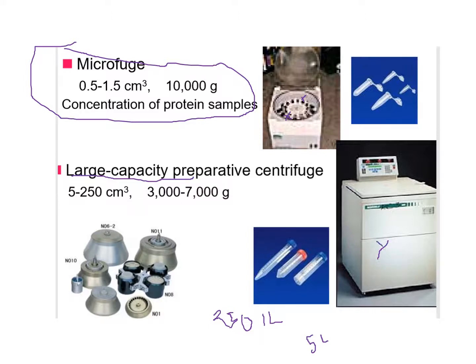In our centrifuge here, this is a steel walled centrifuge, and inside is a vacuum container. Part of that steel protects if the centrifuge fails, i.e. the rotor comes out here, it's going to be spinning at maybe 50 or 100,000 G. I assure you that rotor will go through walls. Okay, so that's called a catastrophic failure. Just look on the internet and look for examples where centrifuges have failed.